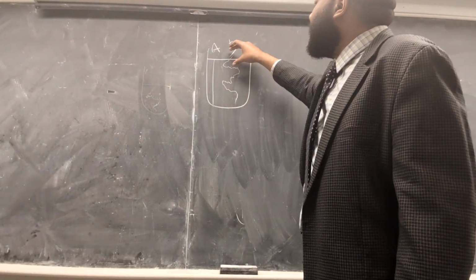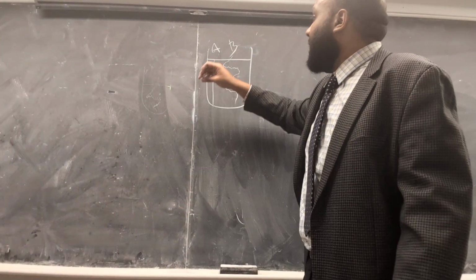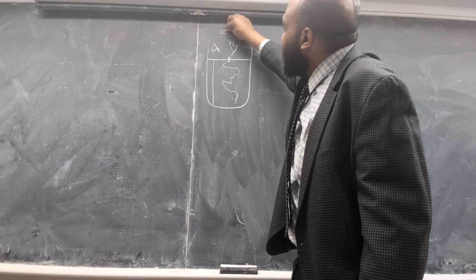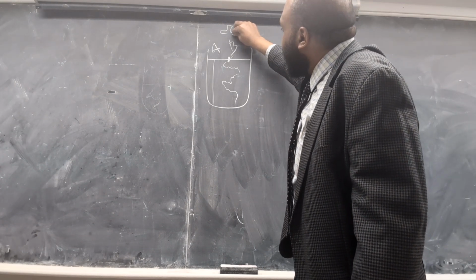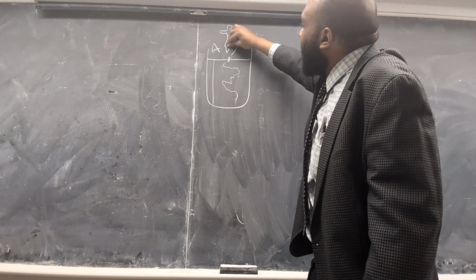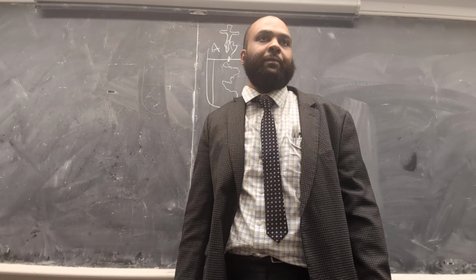So now this solute is diffusing in water, pushing from an area of high concentration. The dropper cap that you use in lab, you squeeze it and then there's a lot of solute here and now it's pushing its way into the water.